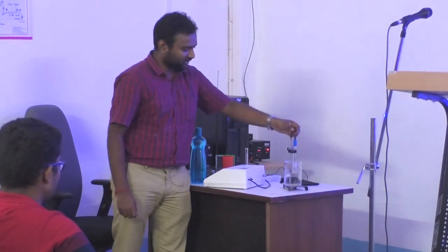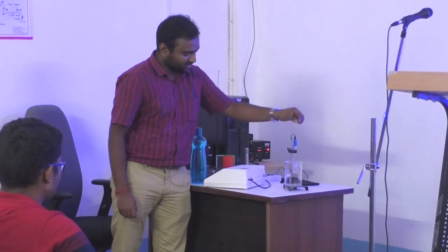Then we have to do the same thing with the neutral buffer. And then we take it out, wipe it with the tissue paper and put in the unknown solution. With this electrode in that unknown solution we will get the actual case, because the potential has been created between 4 and 7, so we will get the pH of the unknown solution. Okay, nice.